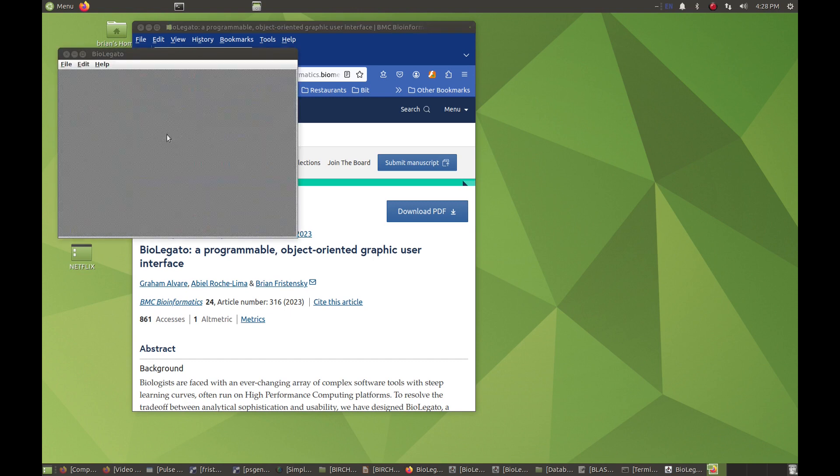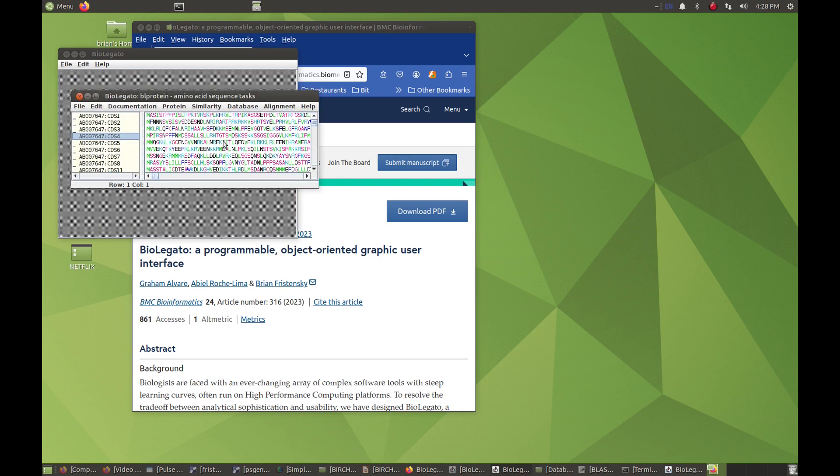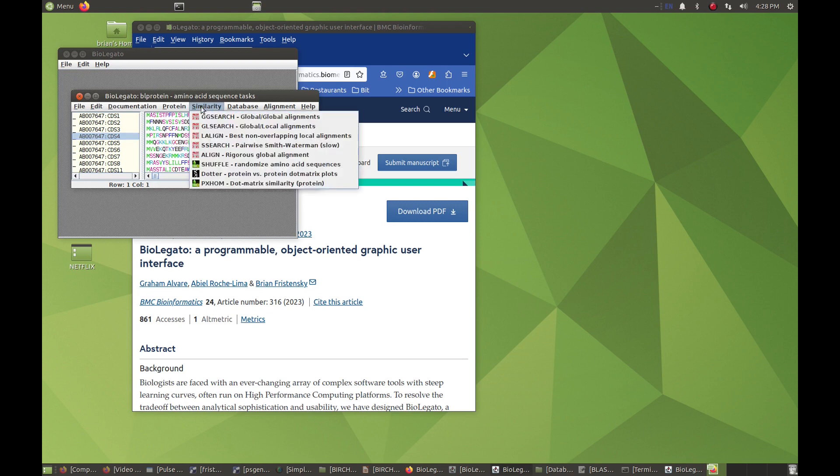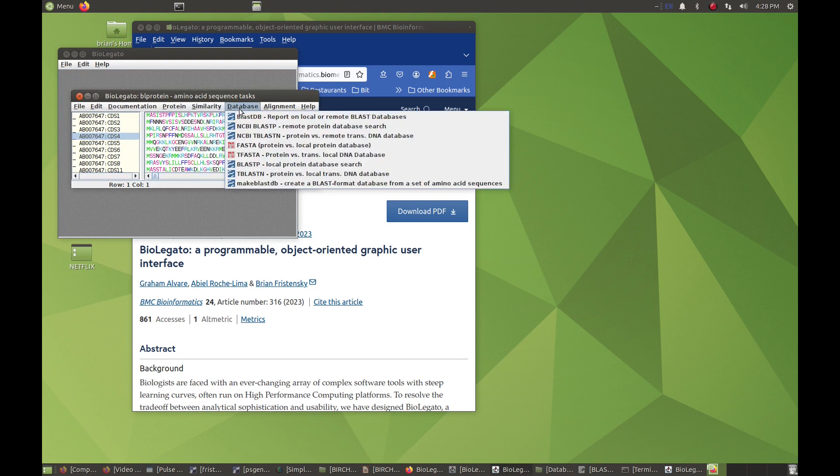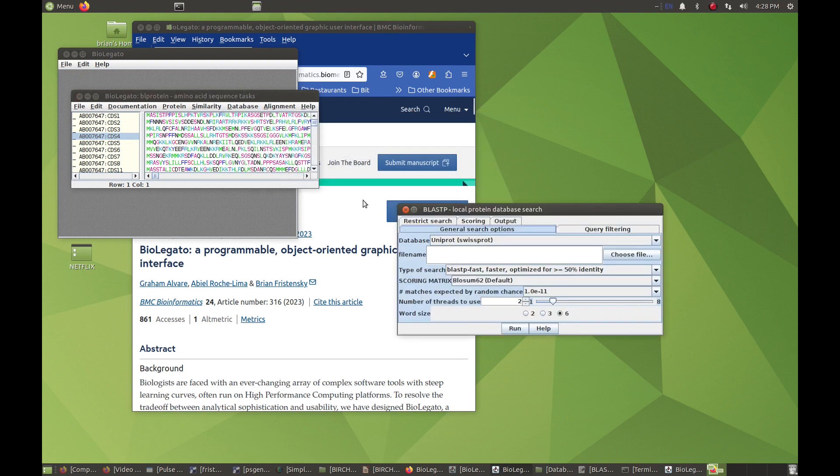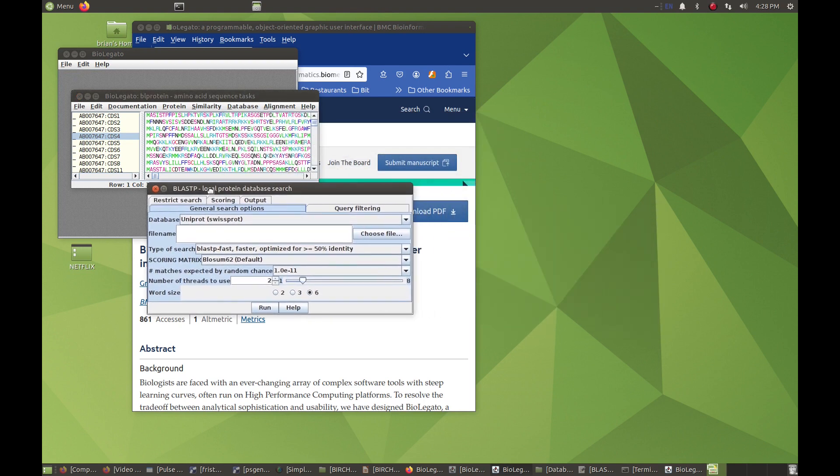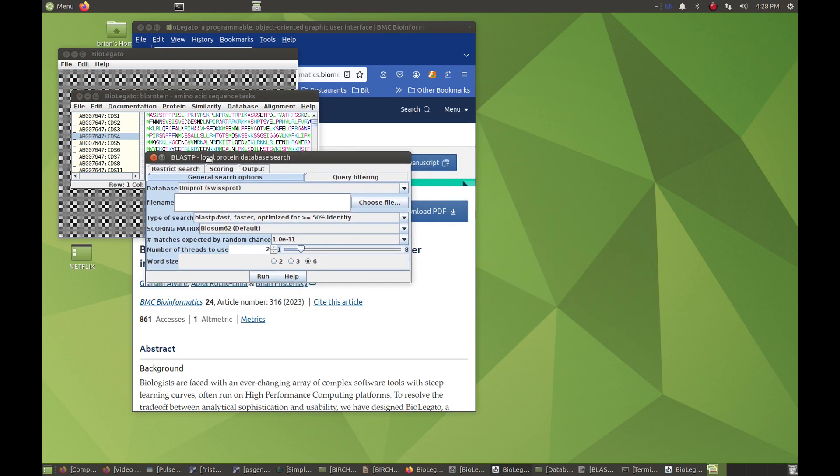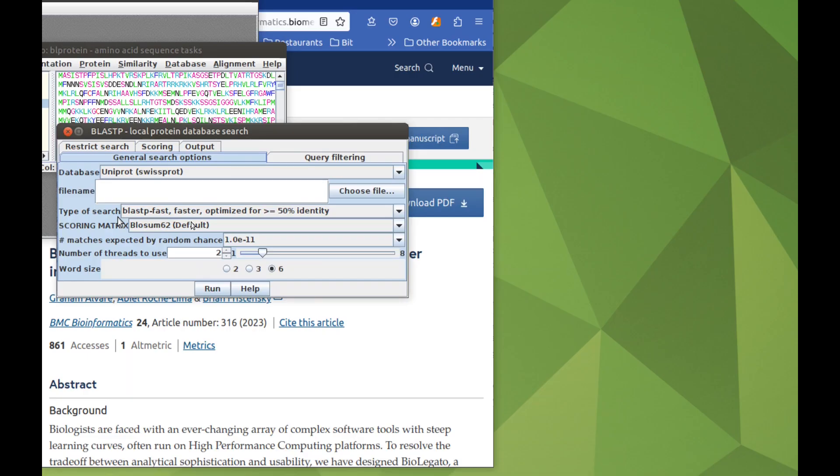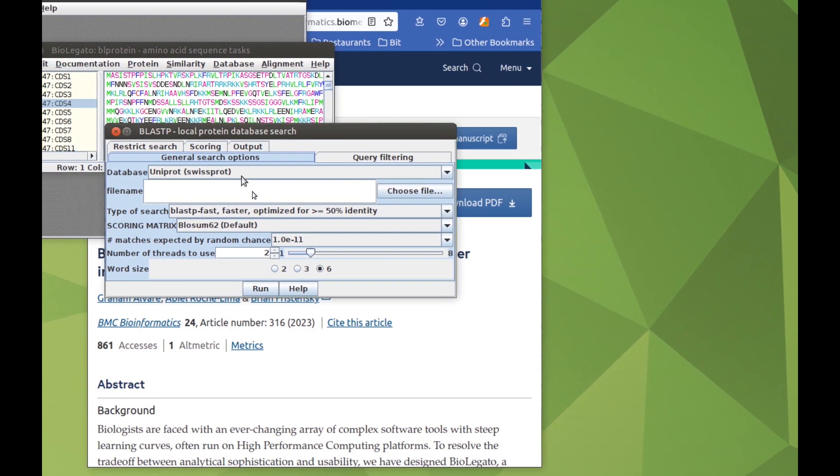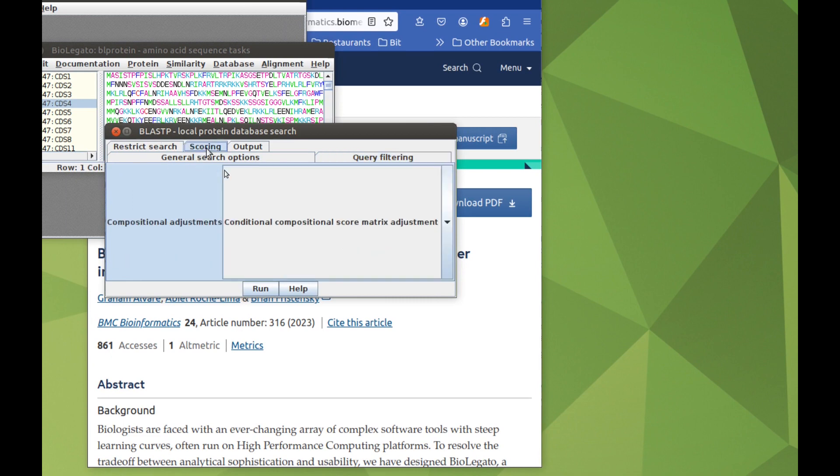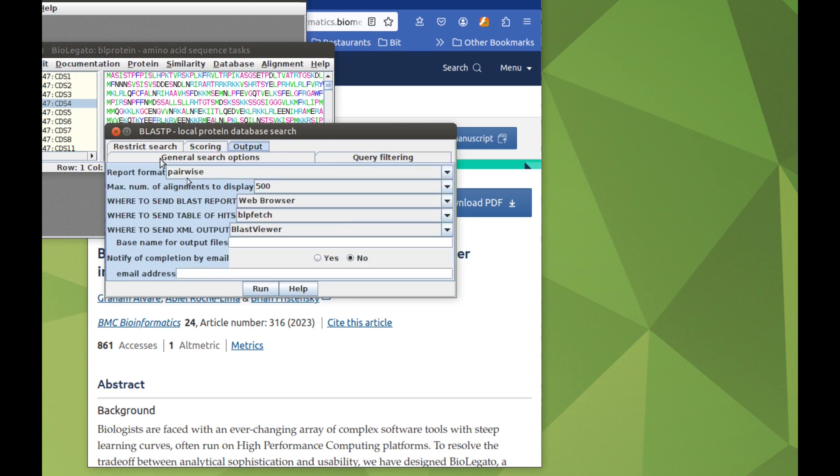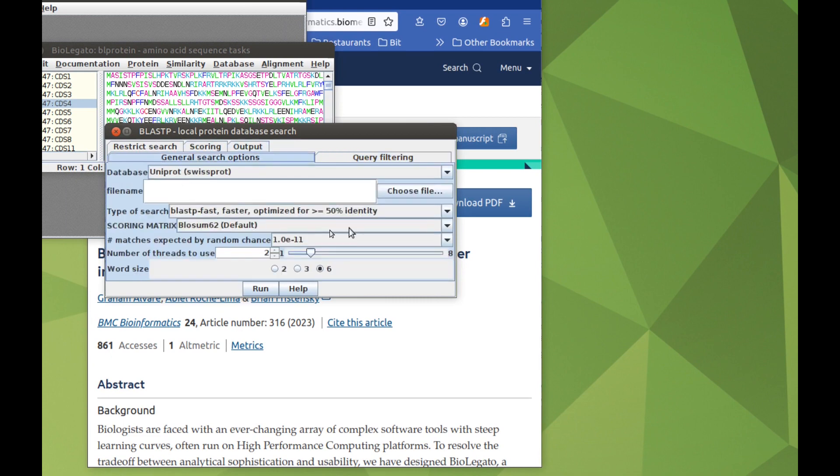By itself, BioLegato does almost nothing. If we launch the BLProtein application, BioLegato reads in the instructions for menus used for launching programs. Here, for example, would be a menu for launching BLAST using the sequence that is selected in BLProtein. Every item in the menu, whether it be for general search options, query filtering, scoring, or output options, is specified using a language called PCD.